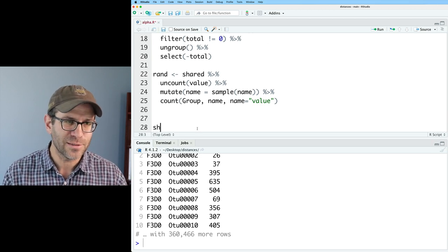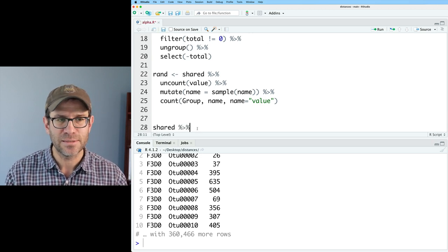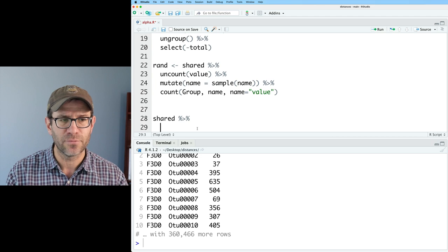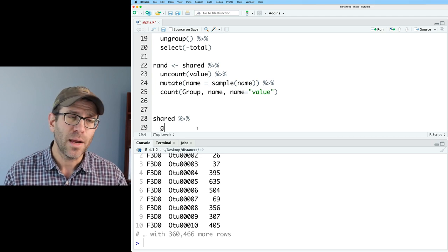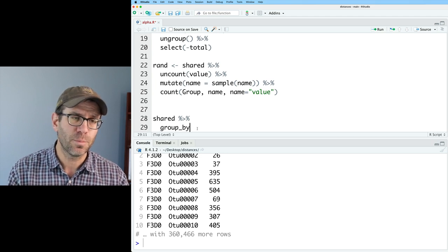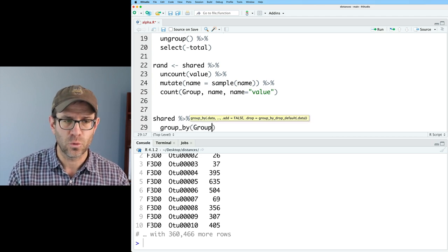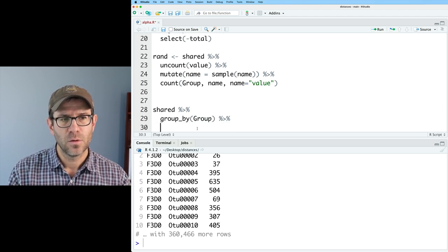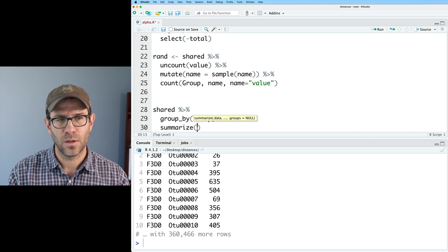So the idea that I'm working with is I've got shared as this three-column data frame. We'll pipe that into group by group, and then we can do a summarize.